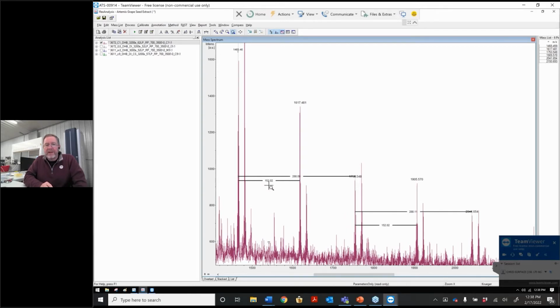That is a gallic acid or a galloyl substitution on the proanthocyanidin. These are hallmarks of authentic grape seed proanthocyanidins. So we know that this has very unique structural characteristics that are similar to what is in a grape seed. The extract is very similar.